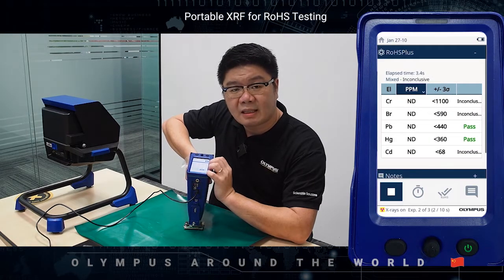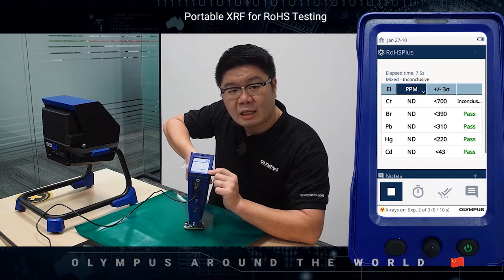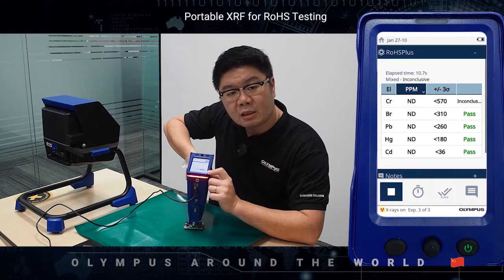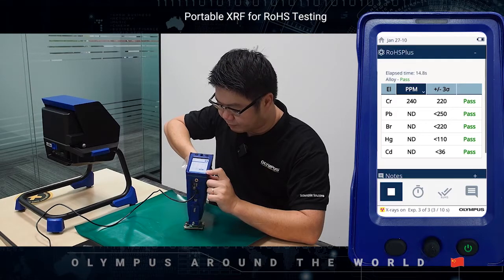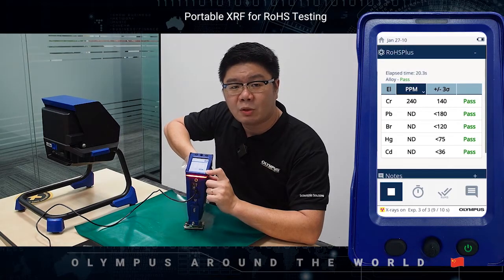As you can see, once the test has been initiated and the X-ray is emitting, there will be a red blinking light. Once the test has been completed, the blinking light will disappear. And in a matter of less than a minute, you will be able to get the result.